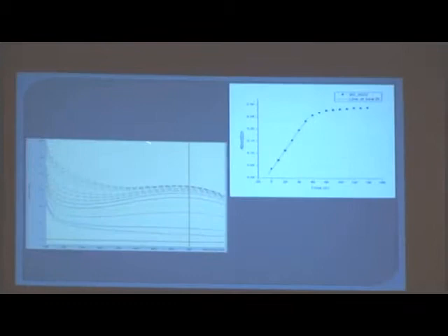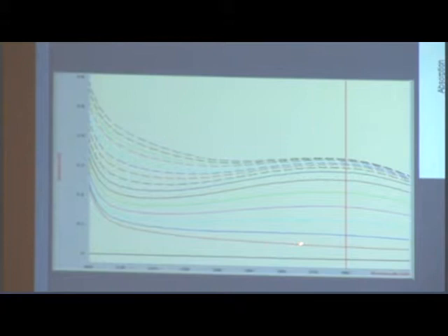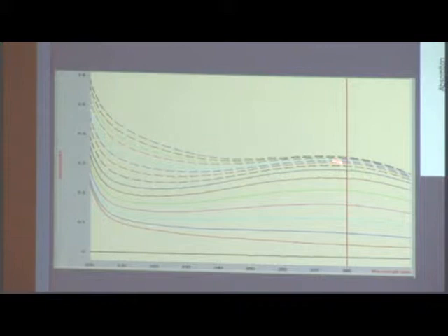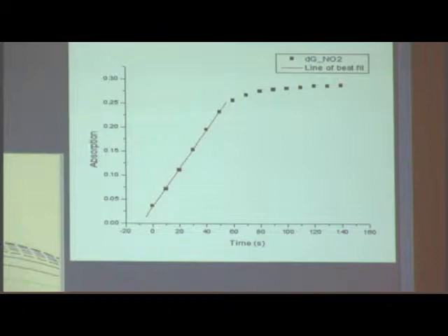So this is basically the result when I used the spectrometer. So you can see different absorbance. The red here is the mixture without the UV light on, and as I go farther, by exciting the light, the absorbance got larger. And then after that, I collected the data into Microsoft Excel, and this is the result. For this one, I used the concentration of 0.5 millimolar.